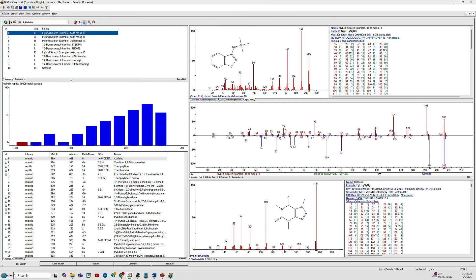If we first do a library search, this will be our unknown at the top. For simplicity of the demonstration I've listed its structure, but it is not present in either of the libraries supplied by NIST, the main and the replicate.